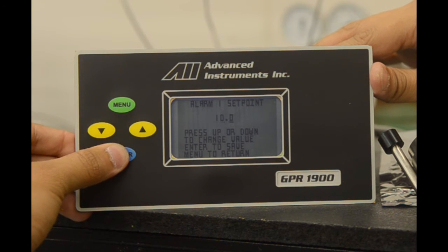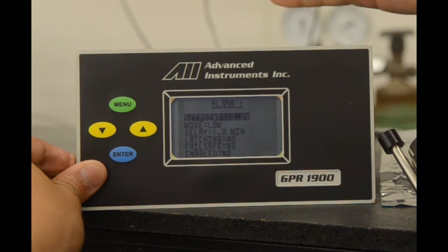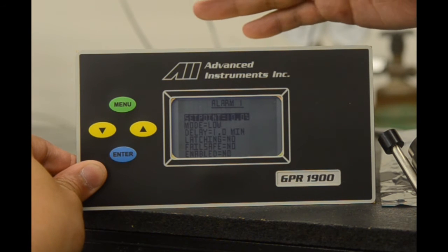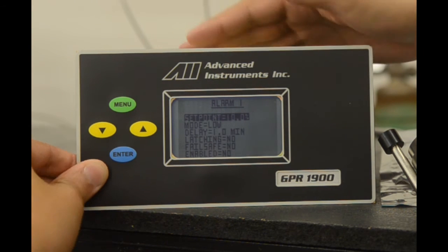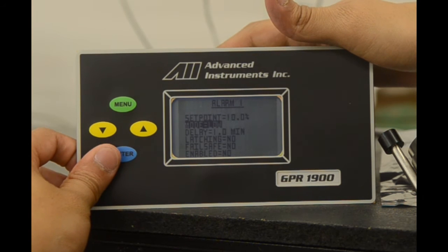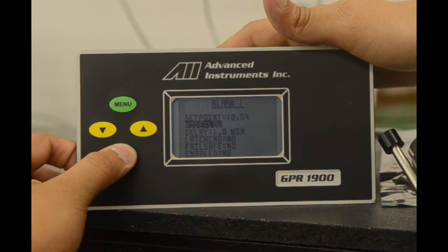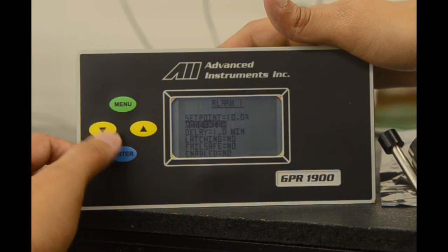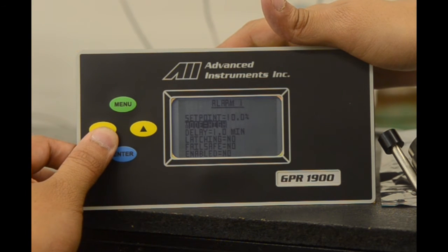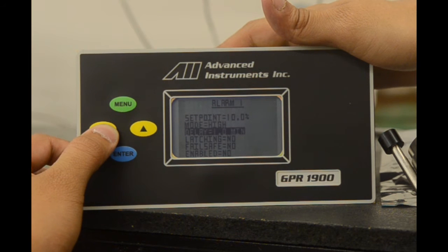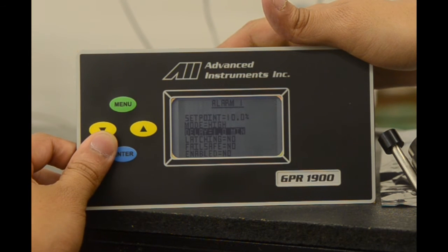The alarm is now set at 10%. Currently, the mode is low. This means that if the oxygen is below 10%, the alarm will fire. We select enter to set it as a high alarm. This means that if the gas is above 10% oxygen, the alarm will be enabled.